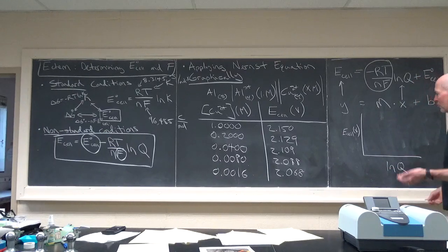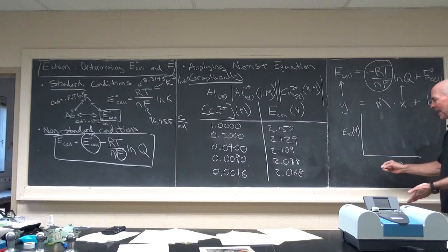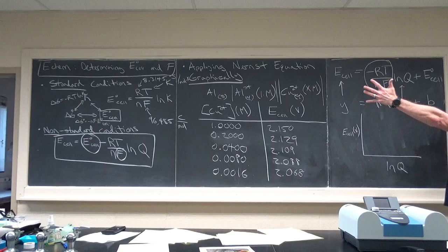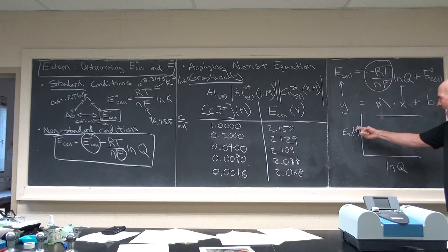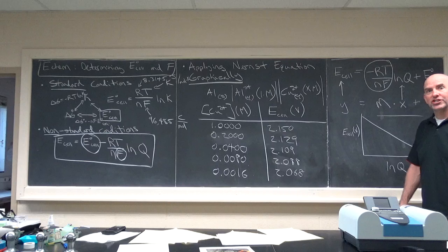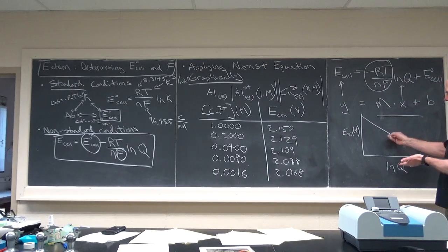Okay, so let's just make sure we understand the graphing thing. Make a big graph, get rid of all the dead space, don't have it at 0, 0. So scale it, make it a whole page, print it out, give it a title, axis labels, units, and the data I gave you should be pretty much a dead straight line. Then you can get the slope and the intercept.